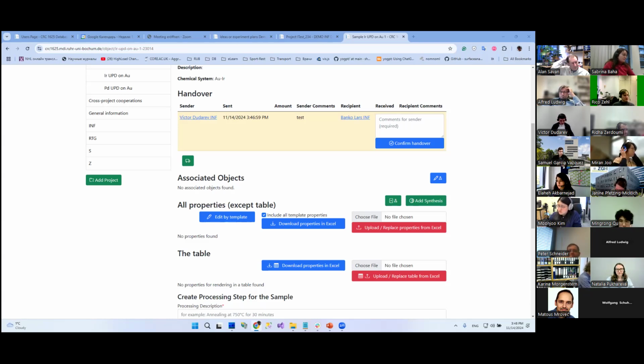Yeah, good suggestion. In principle, it's quite easily doable, which means we can make it. But if only PIs need to be notified, then we should also provide some claim to distinguish between people, because several different persons could be associated with a single project, and then I should know who the PI actually is. But this is manageable. Does someone have a question or suggestion to that?